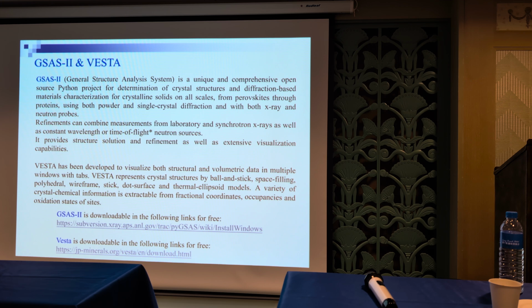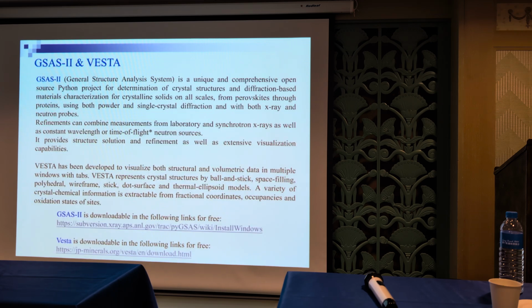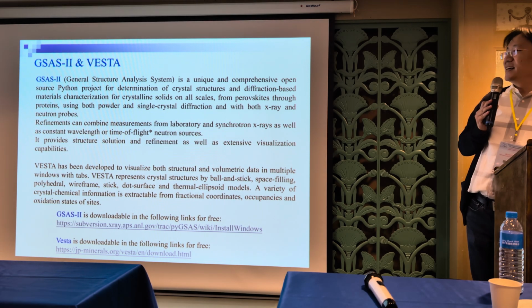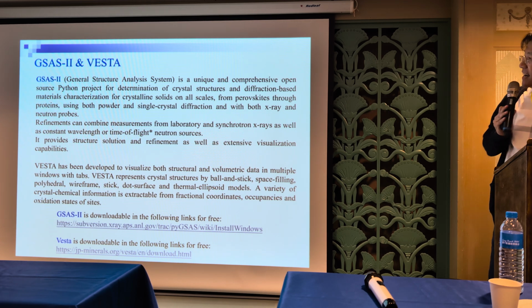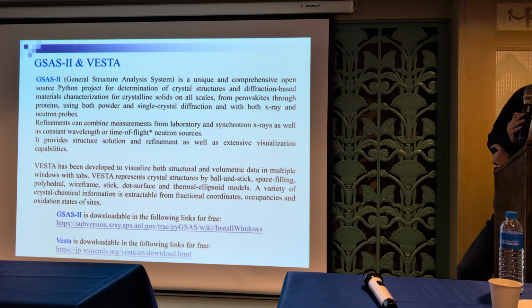Okay, so these are some issues you will meet when you use powder diffraction. And now I want to introduce the software to solve the crystal diffraction pattern. Okay, the typical one we call GSAS-II, but today I want to introduce another one first called EXPO 2014. That would be very, very easy for the elementary user. Okay, but GSAS-II is more professional, and you will find that software in many papers.